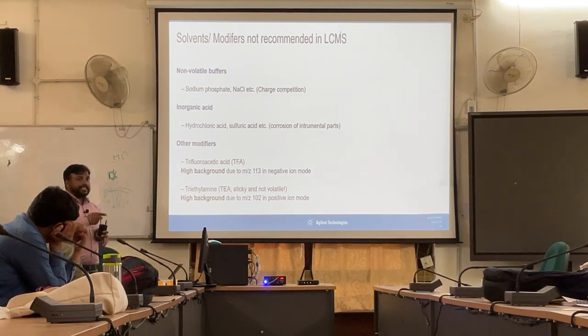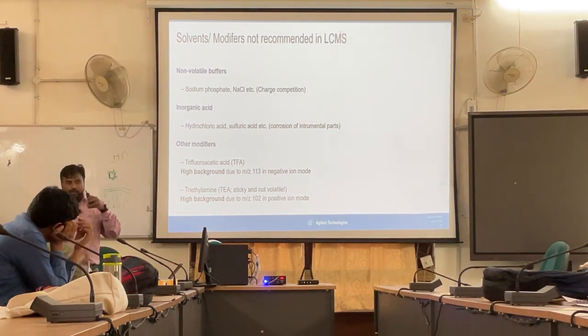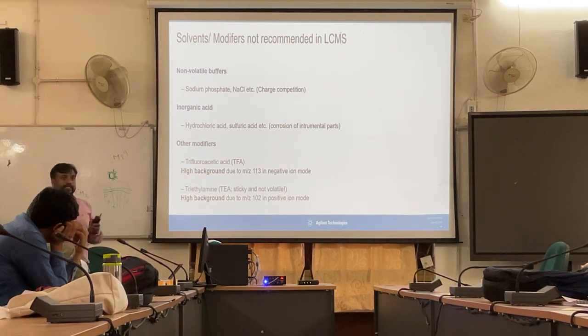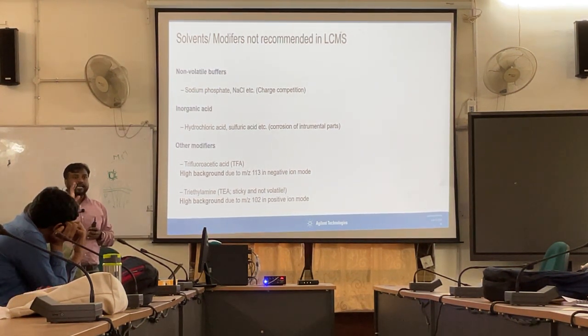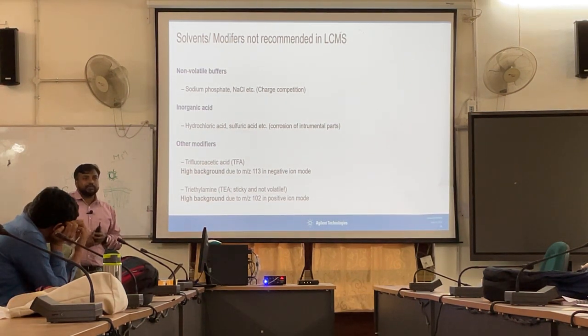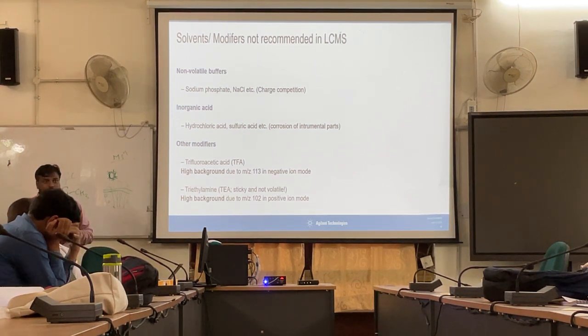In some cases triethylamine is used as a buffer modifier to retain some molecules on the column so you get better resolution on the chromatography side. But we do not recommend this kind of solvent, because it is very sticky in nature. In some cases, preservative chemicals contain triethylamine.